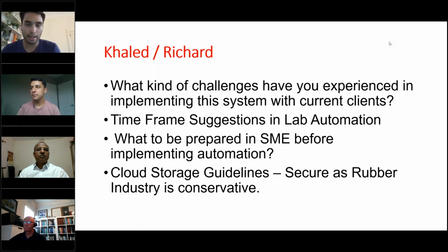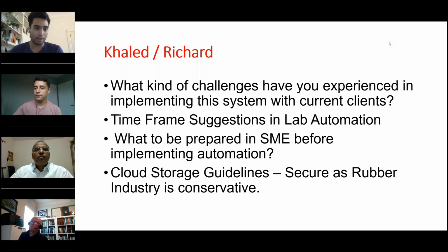But if you make it so that everything is from an Uncountable standpoint, you say, okay, all of your projects need to be done in the Uncountable platform, and upon completion, your reports have to be created in the Uncountable platform. All your testing has to be recorded in here. All your lab requests have to be recorded in here. By making this a top-down approach and making this mandatory, you can help push this change along faster, versus if this is an optional thing to use, then we'll go years and years with people still using the same tool today, because why make a change if it's going to be a little bit more challenging for them to naturally learn and pick up on a new tool?